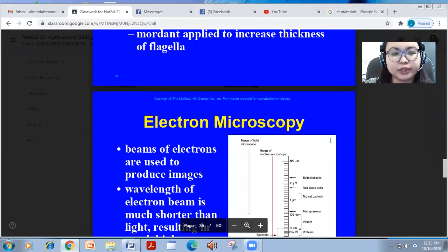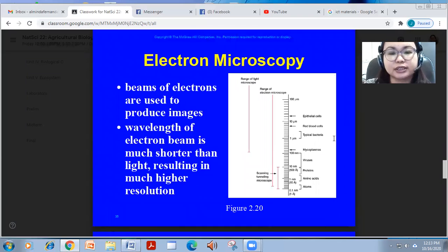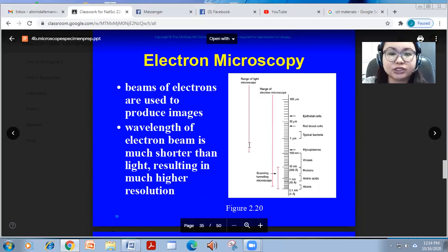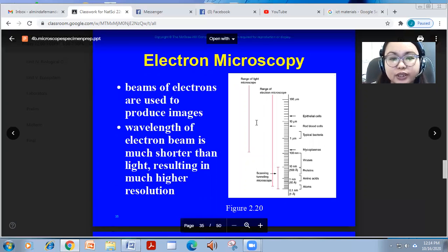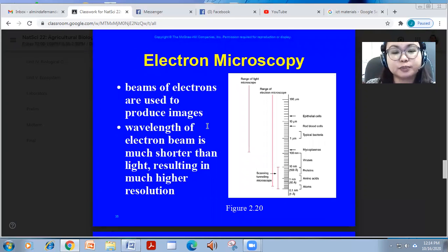So in continuation to the previous topics on microscopy, we're going to discuss now electron microscopy, where we stopped on the previous video. So please check the video, the link that I have sent you on the Google Classroom. In continuation to the electron microscopy, we have this, which is just beams of electrons that are used to produce images.